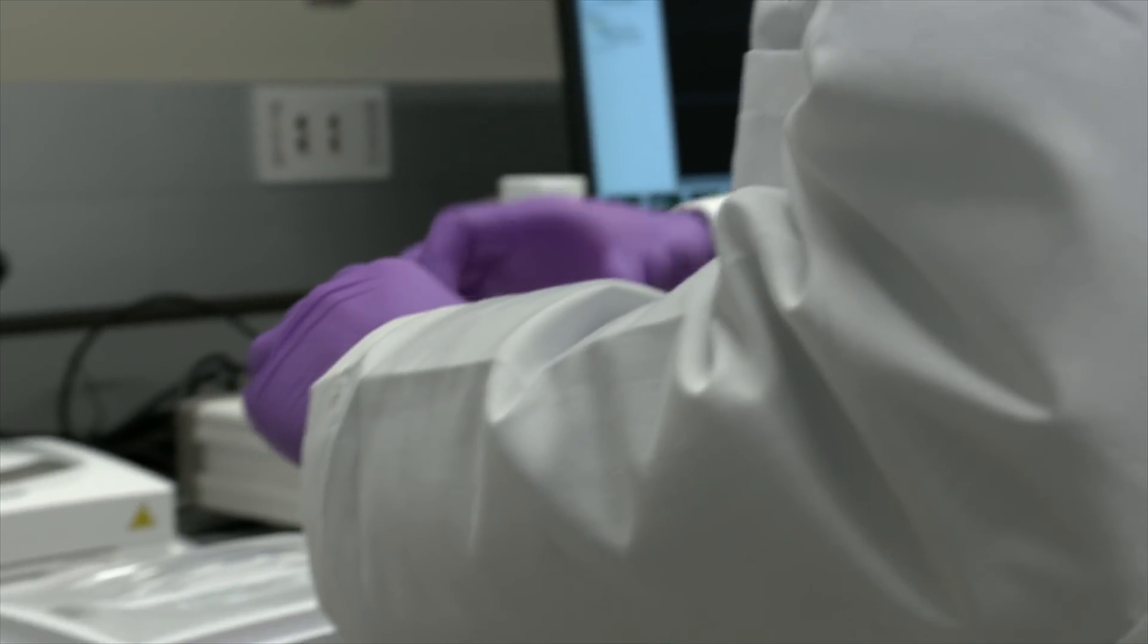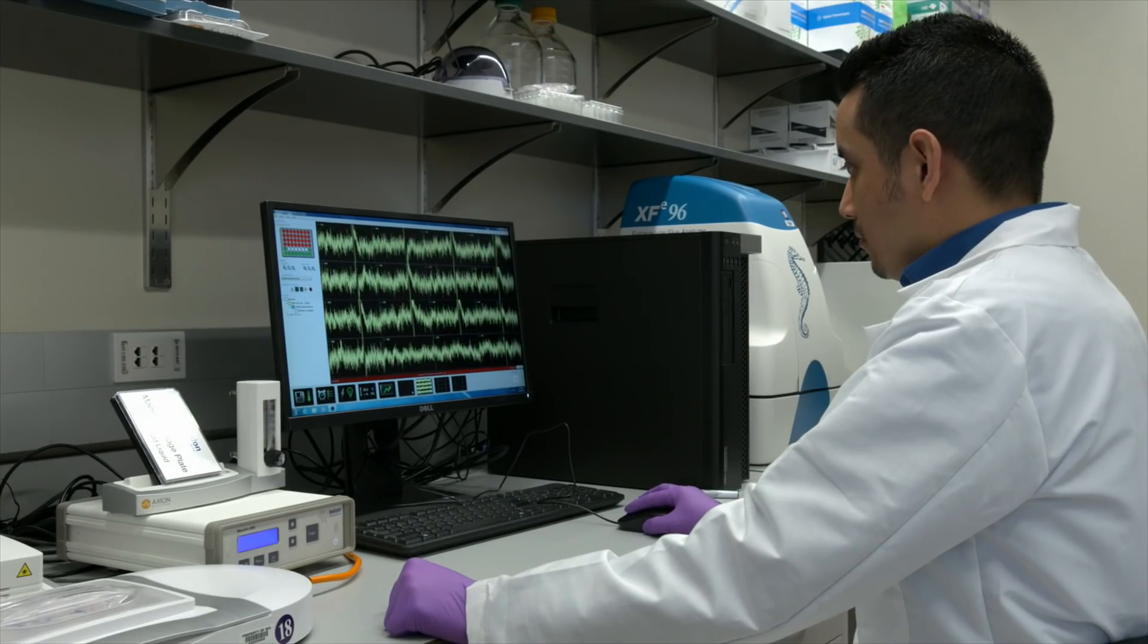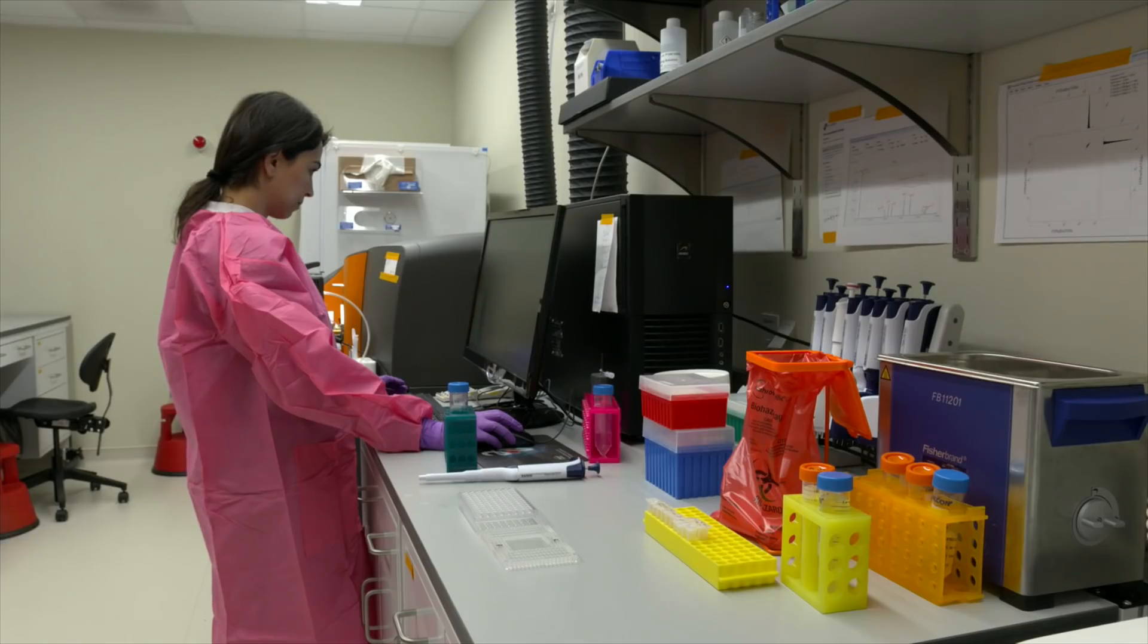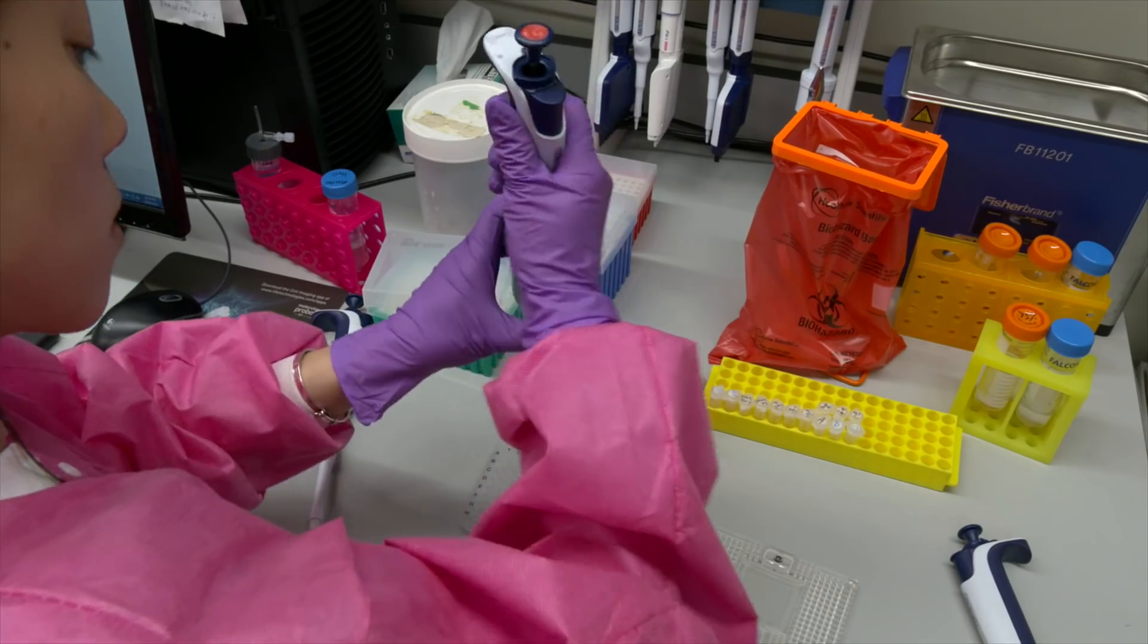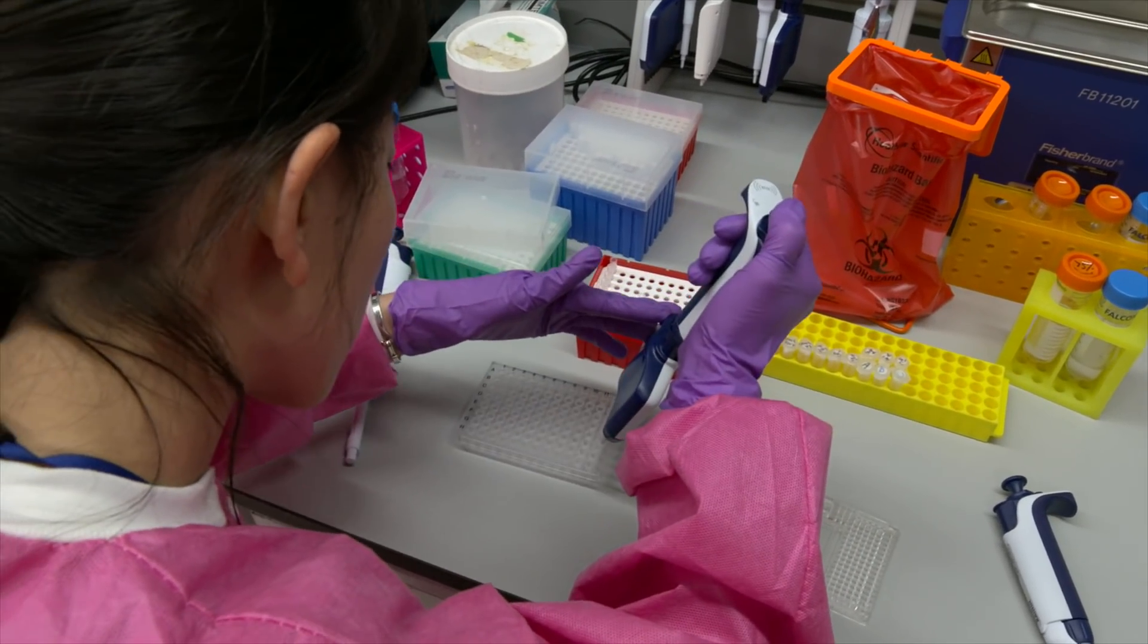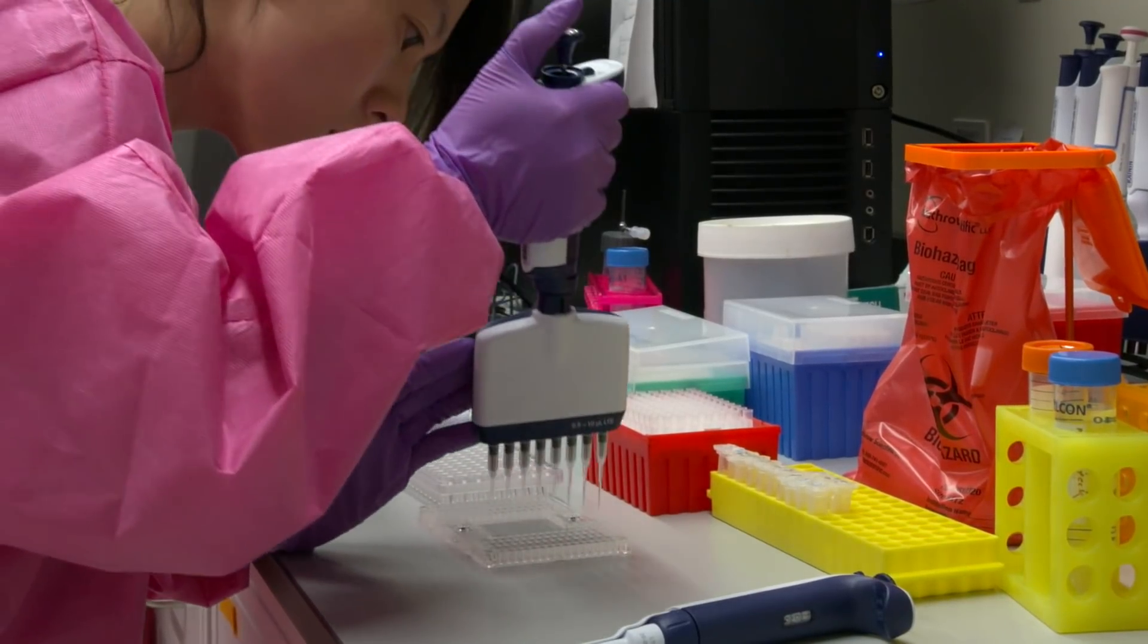Induced pluripotent stem cells, or iPSCs, have the potential to generate all human body cell types. Scientists can use these linchpins of regenerative medicine to repair or replace tissue or organ function lost due to birth defects, disease, injury, or aging.